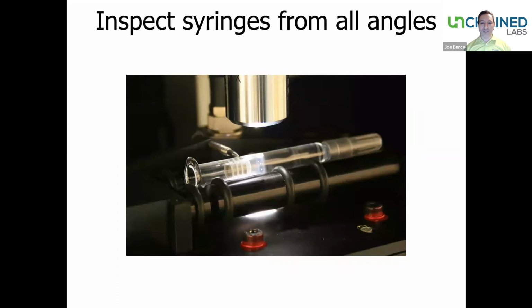The way Bouncer works is, imagine a microscope stage or a microscope. You have a microscope stage that's modified to hold a barrel over the syringe, as you can see here. We're going to shine a light on it. What we're going to do is move the stage in one axis, Y, which is along the length of the barrel, measure light and detect the interference coming back, march along, measure it again, and keep basically marching down the length of the syringe.